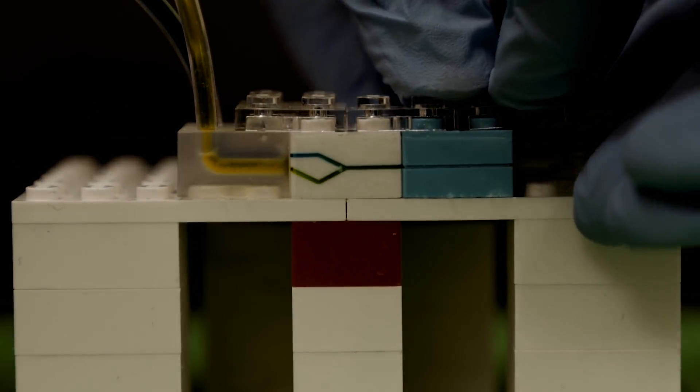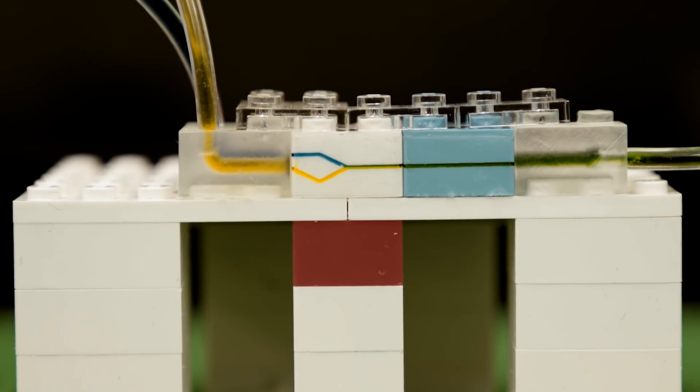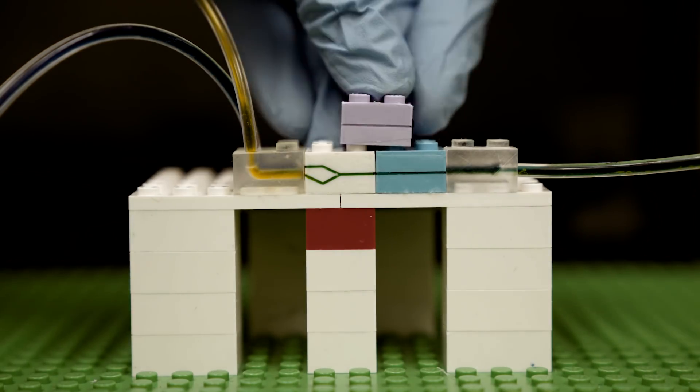Moving forward, the researchers plan to experiment with different coatings to make the bricks compatible with different fluids. They are also thinking about designing LEGO-like bricks made with other materials, like polymers, with higher temperature and chemical resistance.